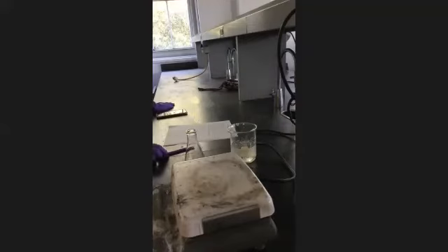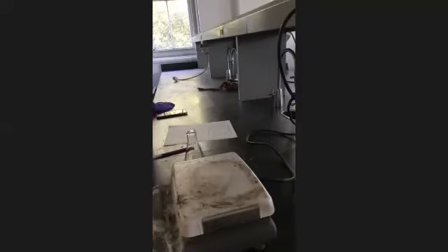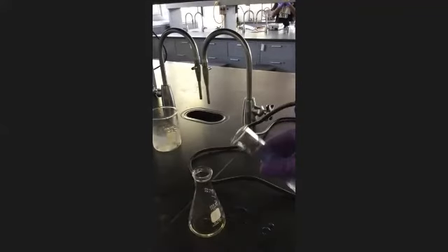So Kayla, are you ready? You ready for water, right? So we're gonna add 40 mils of distilled water straight to, no, not to that. That's gonna be a wasted trip. We're gonna add 40 mils of distilled water right to the aspirin. So let me move this back so everybody can see. Make sure I don't drop the iPad. All right, so we're gonna add this just right to here.